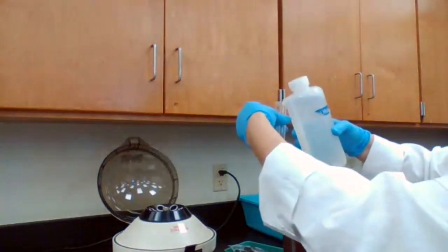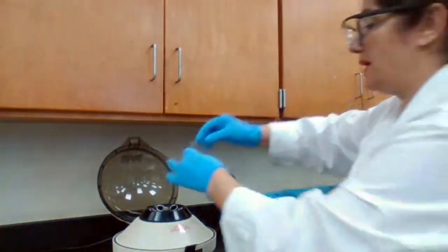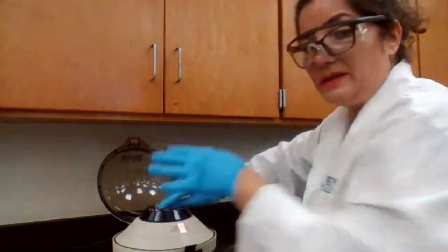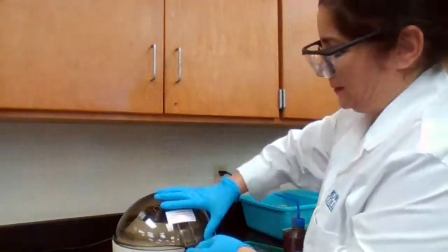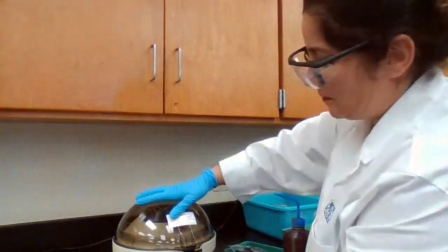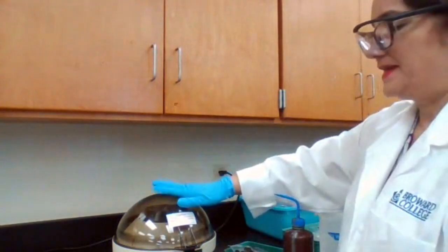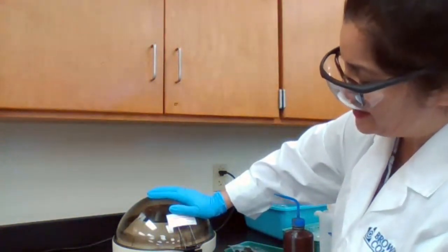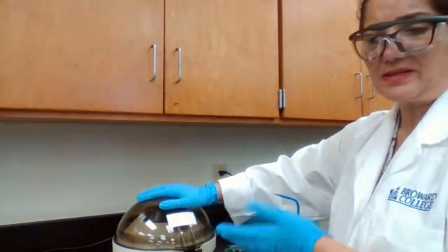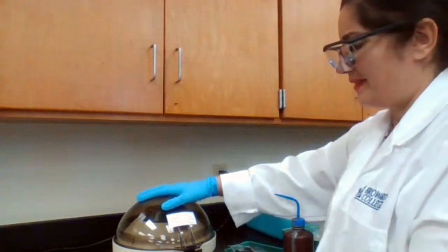I'm going to get the same amount of water in another test tube and place it in the opposite direction in the centrifuge. Close it and turn it on. Well, this centrifuge, its increments are in minutes. So if I need 30 seconds, I just have to time it or approximate 30 seconds and turn it off.